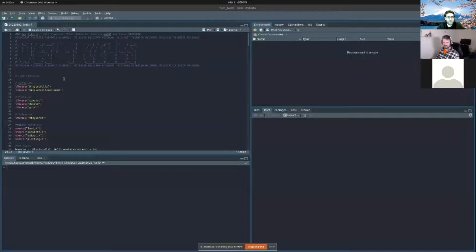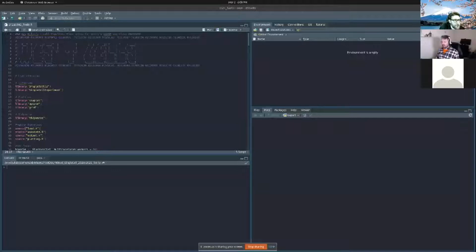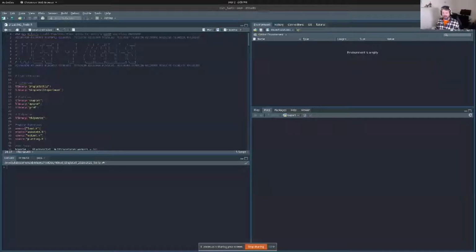Will do. Gonna share my screen. Boom. So I just want to thank Henry for inviting me to share some tips and tricks I've learned along the way. I'm not going to go through my entire pipeline because that would take too long and take up too much of this class, but I will go through some of the ways you can do this stuff outside of scRNA and some tricks that you can probably work with, even if you use scRNA, if that's going to be your bread and butter. Some of these tricks will even work with it, and I'll show you how that works.